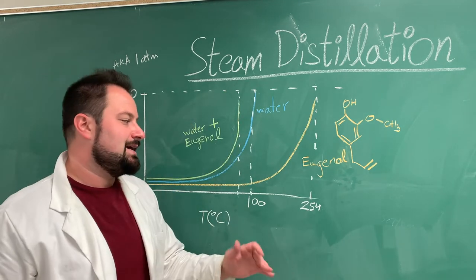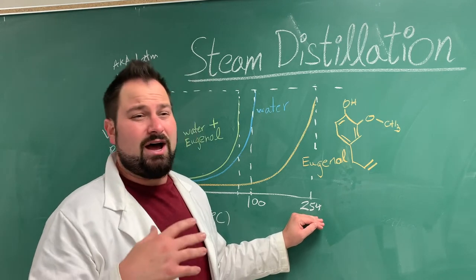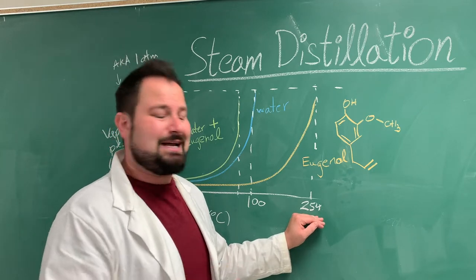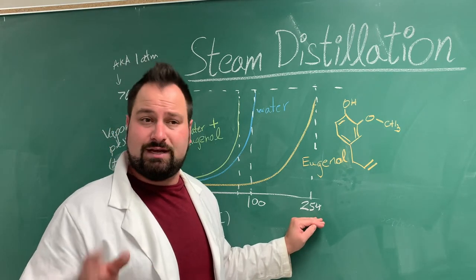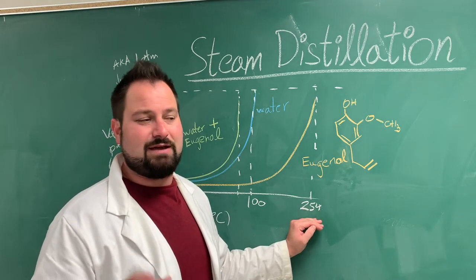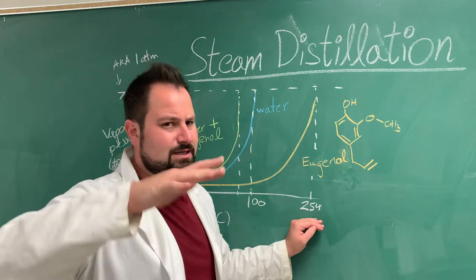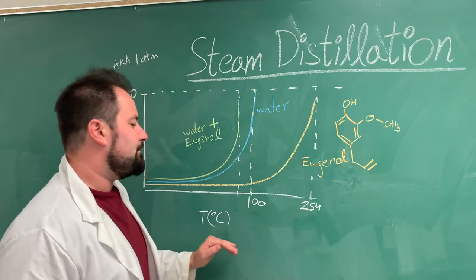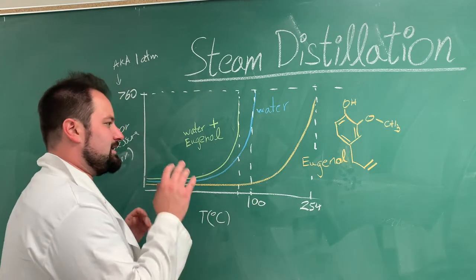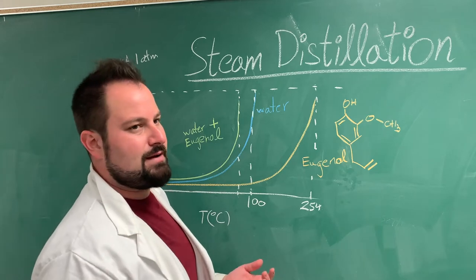The benefit of doing this is that at 250 degrees, organic compounds tend to start decomposing. Not great. Plus, in general, it's a little dangerous getting to those temperatures. Our thermometers can't get to those temperatures safely. They can for a little bit, but we don't want to go any higher, so it's kind of that risky area. If we can keep it lower, we do want to keep it lower. So this allows us to get the eugenol over without having to go to those kinds of temperatures.